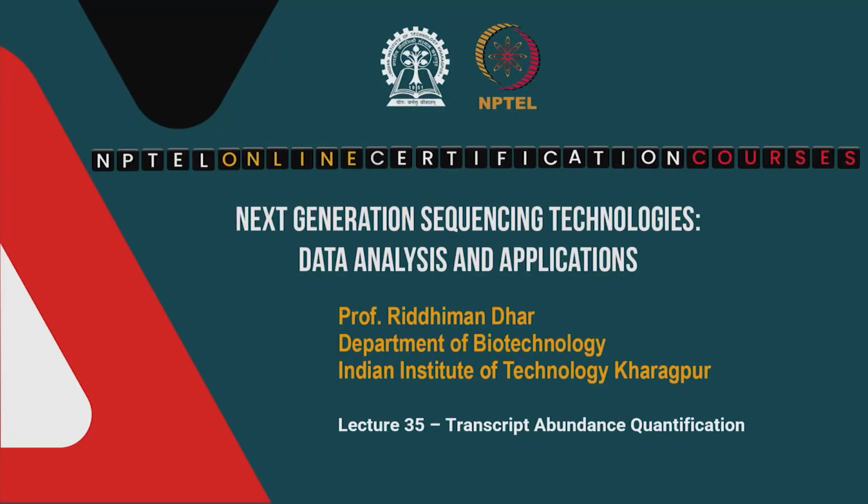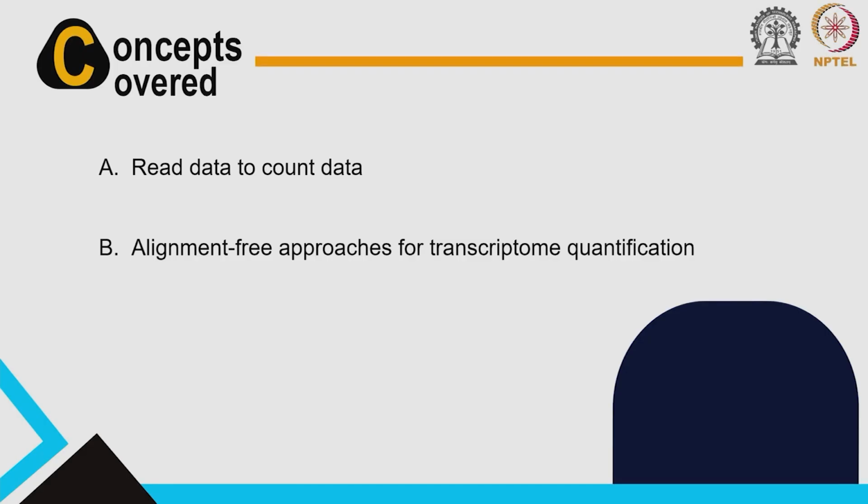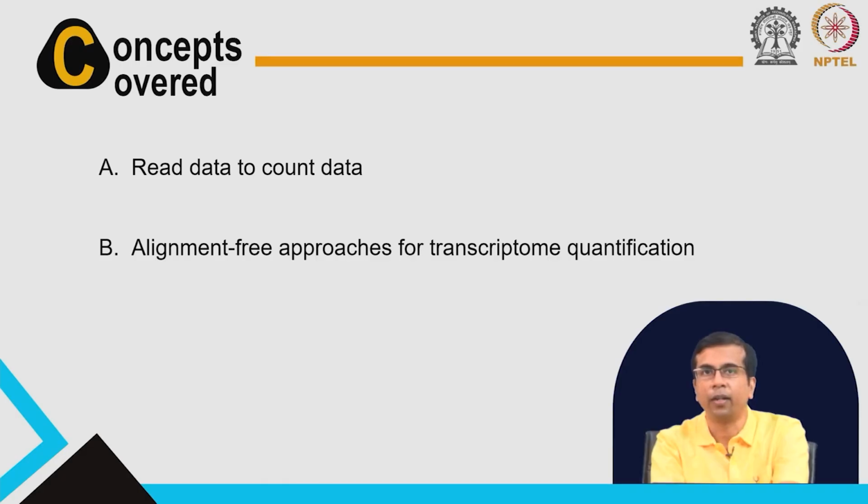Okay. So, here are the concepts that we will be covering in this class. We will talk about the read data to count data process, we will talk about some tools, and we will also have a look at how to do this ourselves with a small hands on, and then we will talk about alignment free approaches for transcriptome quantification.